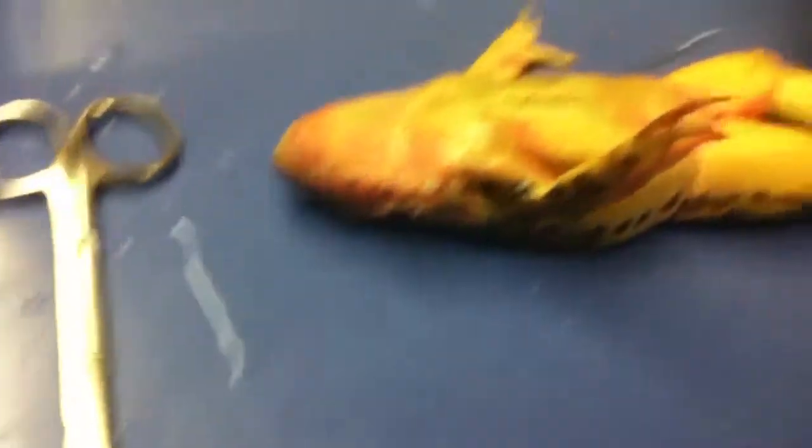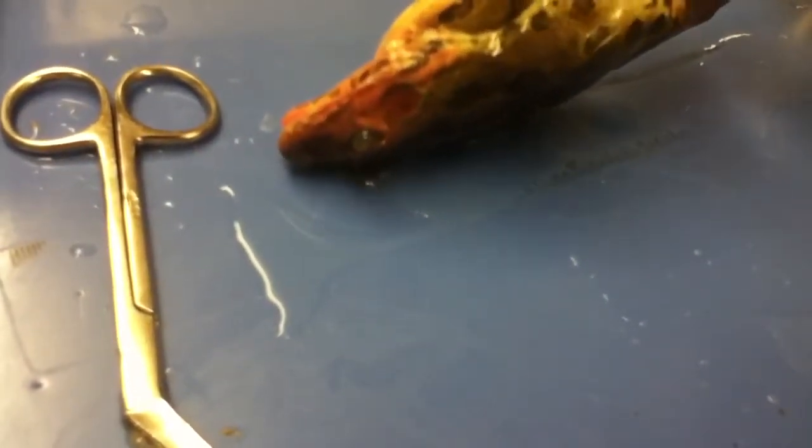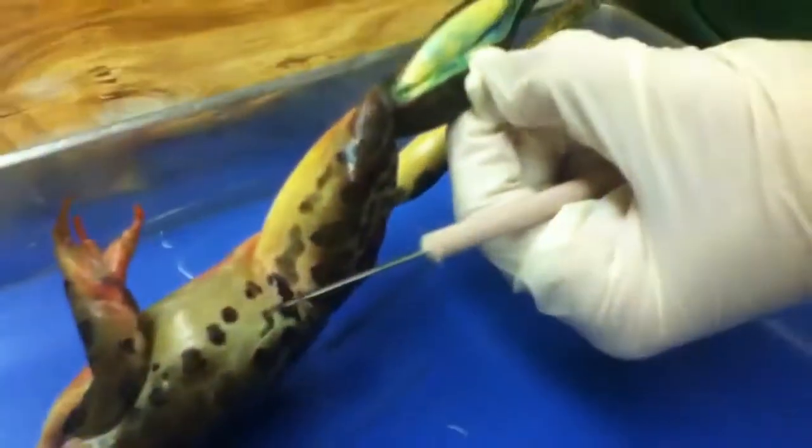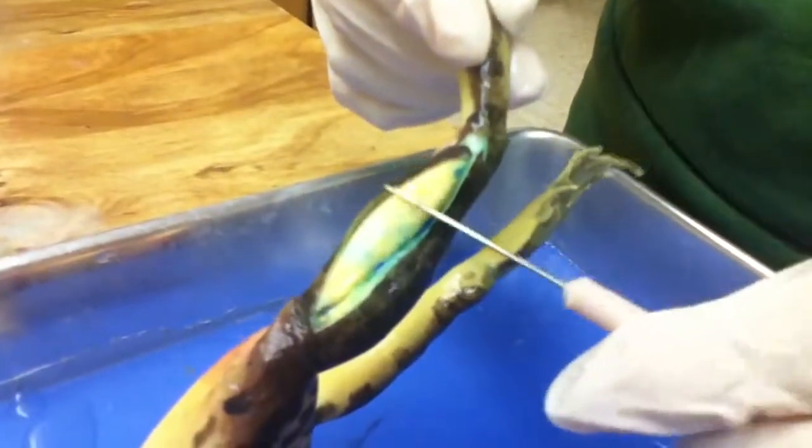Some frogs are like our frog's legs, like right here, is cut open. He's dyed blue. You can see his muscle, like that's his muscle. If you were to eat a frog, that's the part you would eat because it's like his meat.